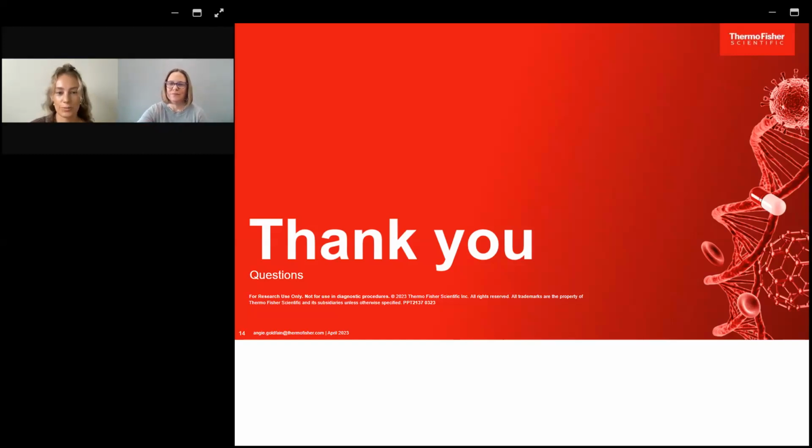Awesome, thanks. Next question. Does drop delay stay relatively the same between events, even if the cell population is heterogeneous? So when you're calculating drop delay, different instruments do it differently. In this case, the image I showed came from the Bigfoot cell sorter, and we actually calculate the drop delay based on the middle of the pulse.